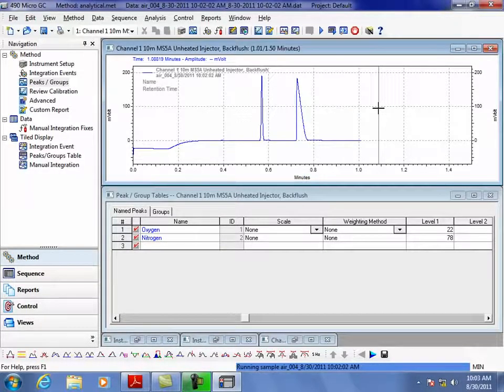and the range that it might actually happen is 100 parts to 1%. Then if I do 100% as a gas and just draw it through 0, that might be accurate, but maybe not. This one should be fairly accurate, but not really accurate.